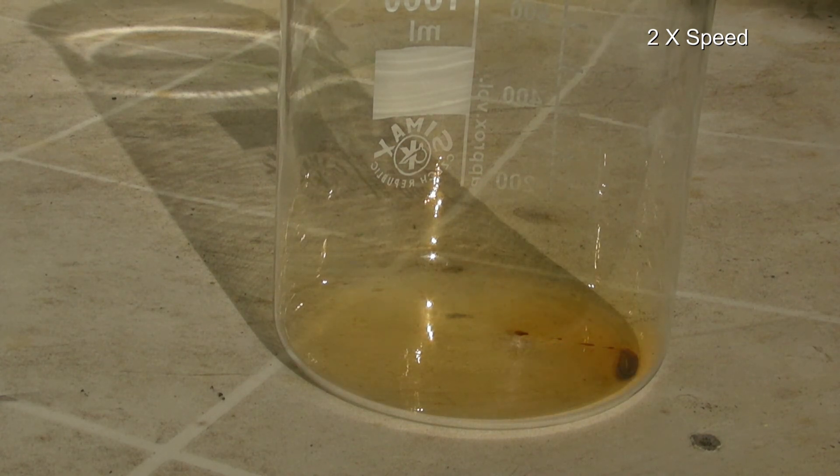This was the preparation of bromine on a small scale. I hope you enjoyed — please rate and comment.